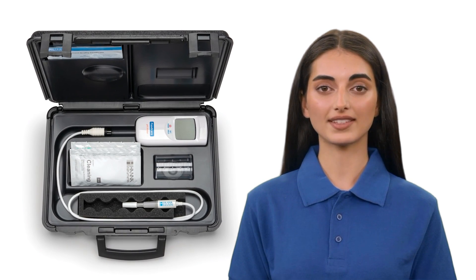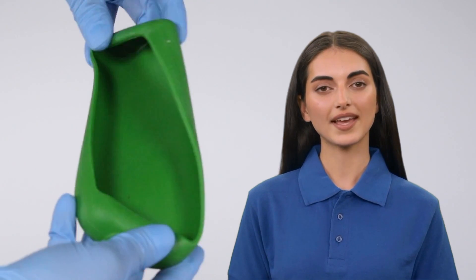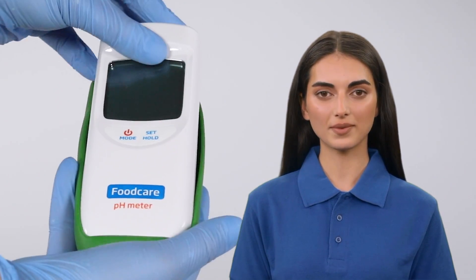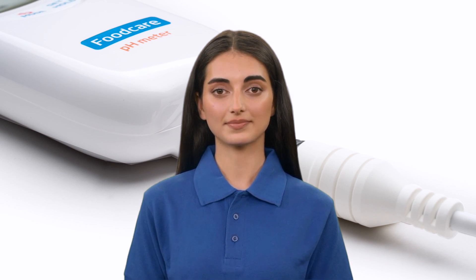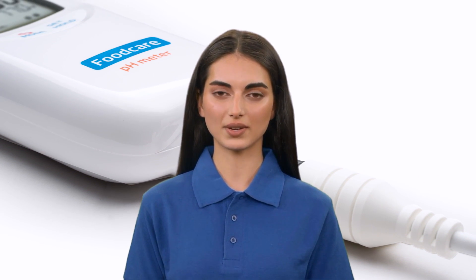This portable powerhouse comes with a hard-carrying case for storage on the production floor, and can be outfitted with a shock-proof boot for better durability. We hope that this is the meter for you. Thank you for tuning in, and always remember, better testing starts with Hanna.